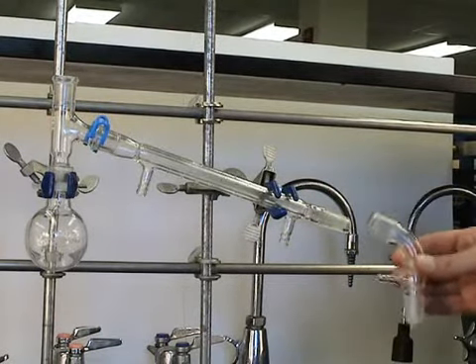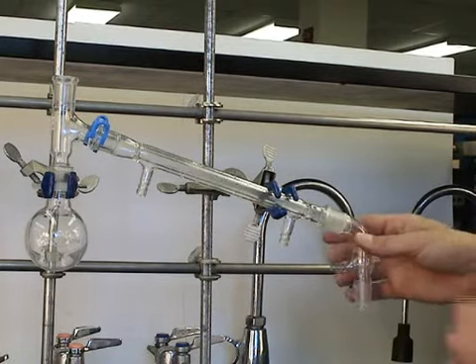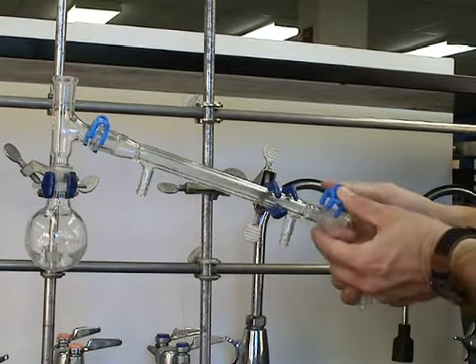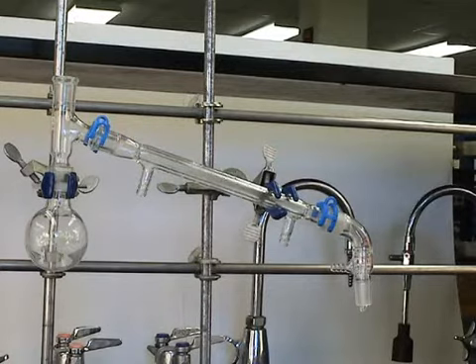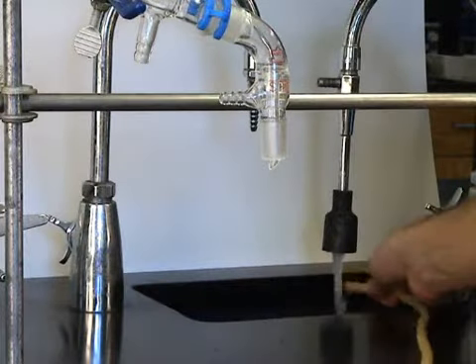We use a vacuum adapter as an elbow at the end of the condenser so that our distillate drips into our receiver. And that's attached again with another Keck clamp.